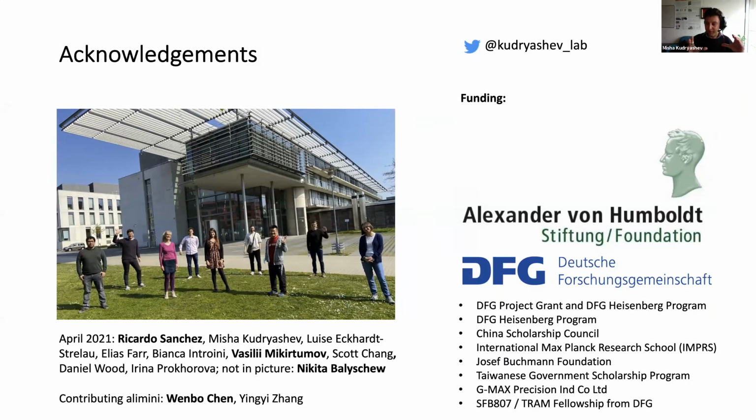So our first paper and the first structure was with 15 electrons for the untilted image, and I think about 100, 120 for the entire exposure. However, lately we started putting more dose into the untilted image. And I think at least for the ryanodine receptor, it works rather well because it's large. And that's true, the quality of the tomogram doesn't have to be very superior, because essentially we only needed to get maybe a 15 angstrom structure, and then we go to the projections. So I think there is some wiggle room to play with.